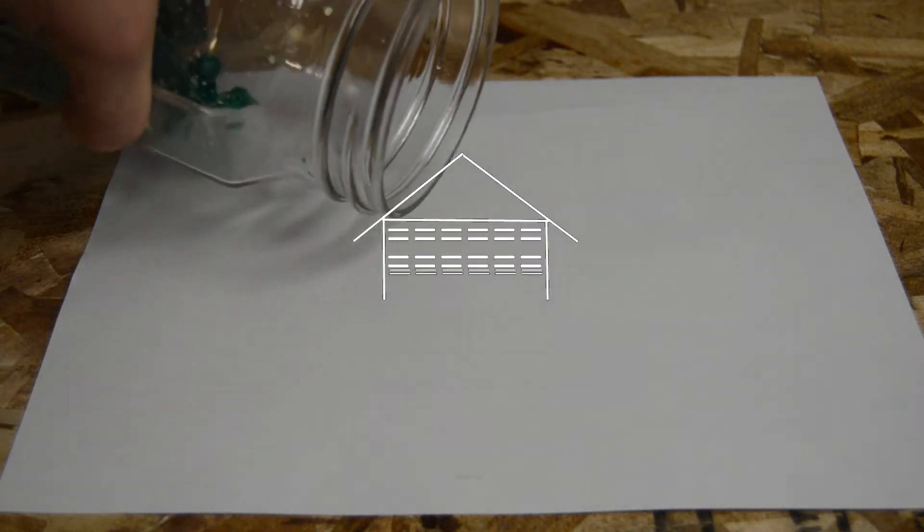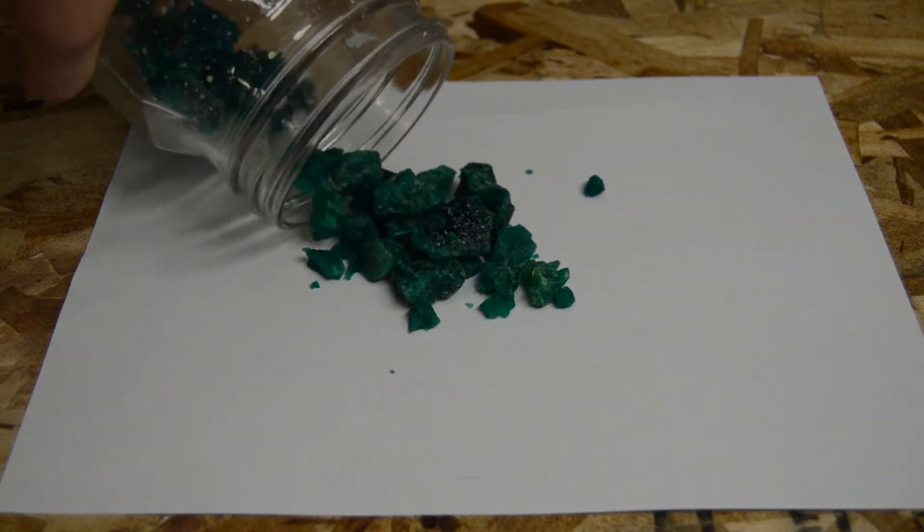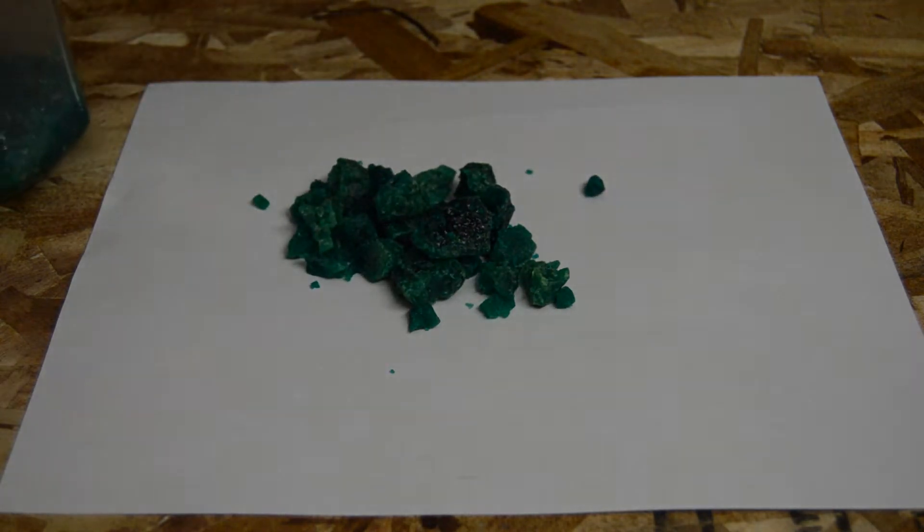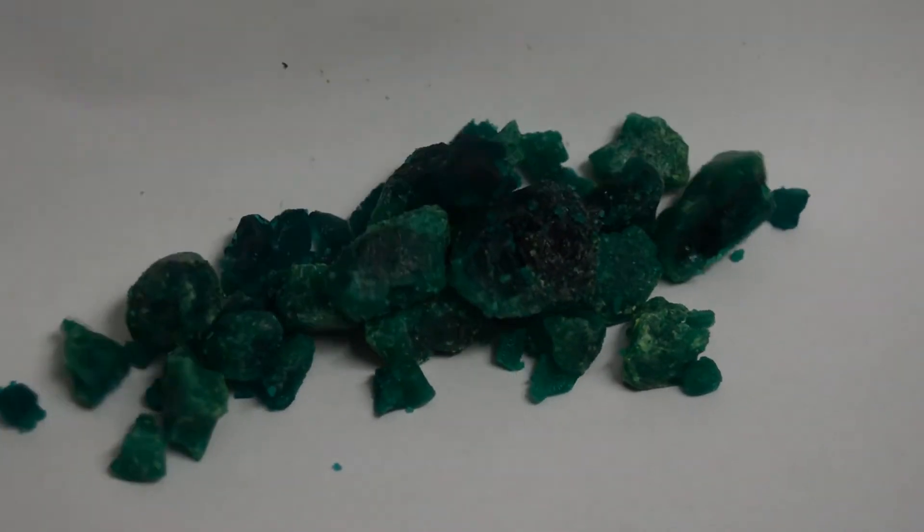Welcome back to Garage Science. In this video I'll be showing you how to easily and safely make nickel sulfate crystal from nickel metal. This nickel sulfate can then be used in various experiments to include nickel electroplating.